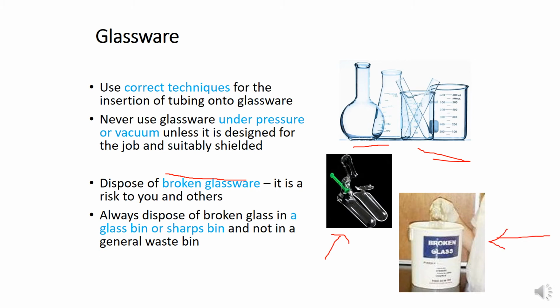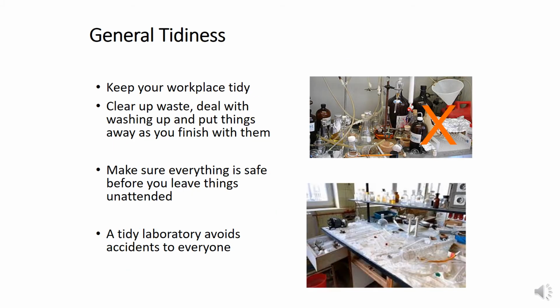The disposal of broken glassware is very special, and also very isolated. So you cannot throw your broken glassware into the normal disposal. There is a special bin that is used for this. Okay, thank you so much.